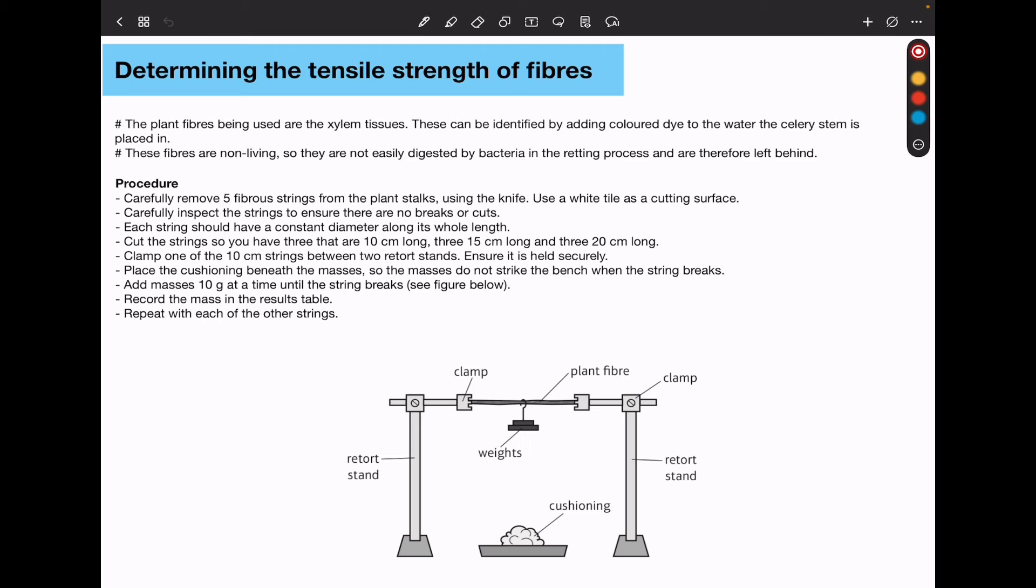You can clamp one of the 10 cm strings between two retort stands. We can see the retort stands here, and then the clamped fiber here. You have to make sure they're securely clamped, and then place the cushioning beneath the masses. In this case, we can see the cushioning here, so the masses do not strike the bench or the floor.